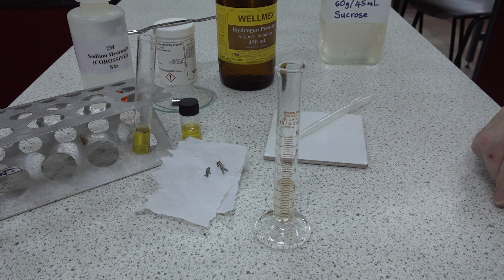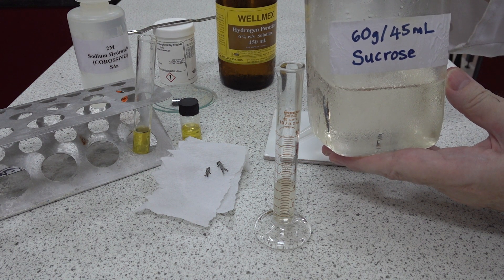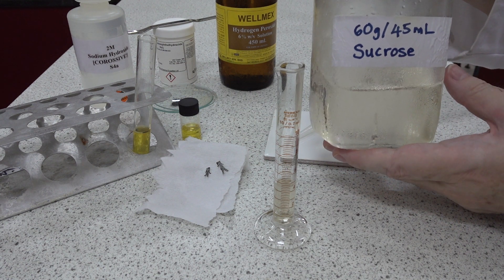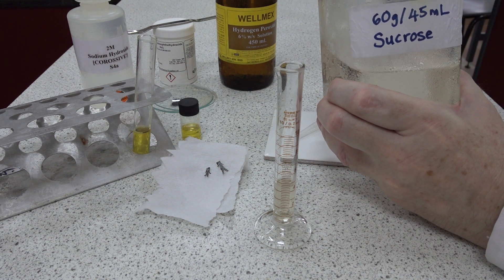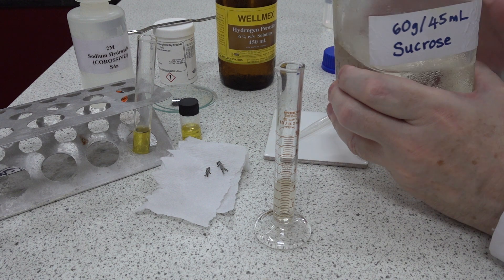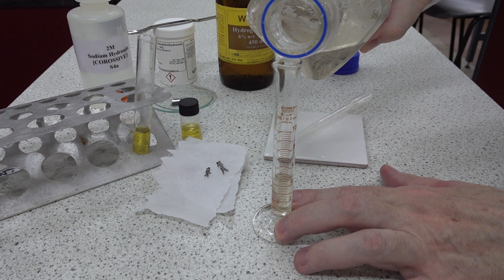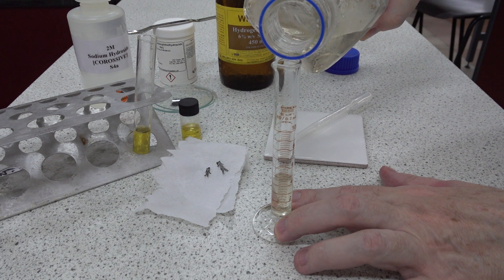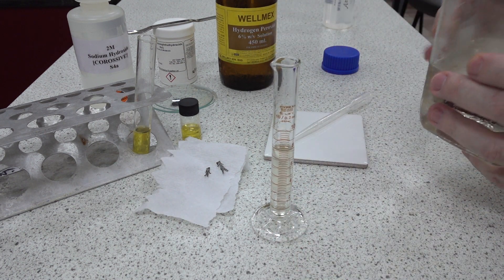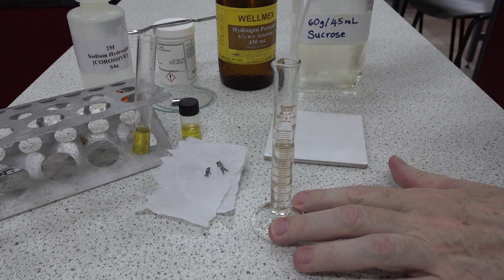Next, we're going to increase the density of this layer by adding about three milliliters of a concentrated sucrose solution, which was made by dissolving 60 grams of sucrose into 45 milliliters of water in that proportion. That takes us up to about seven or eight centimeters cubed. We need to ensure that it's thoroughly mixed.